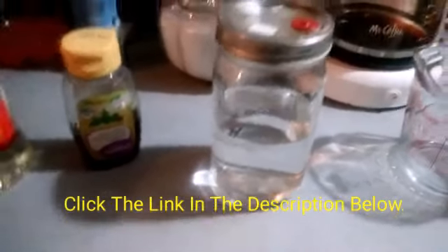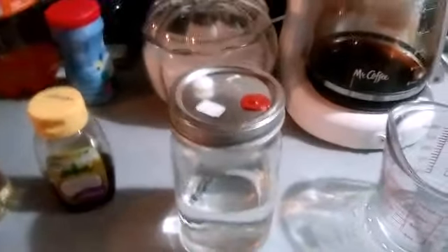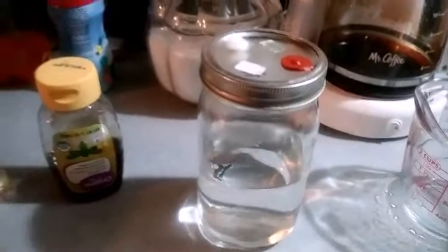I'm going to pressure cook it. Of course, you got to put foil on it before you stick it in the pressure cooker, and you're going to pressure cook it for 15 minutes at 15 psi.